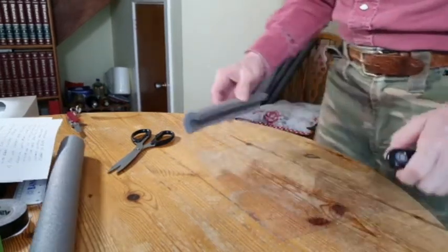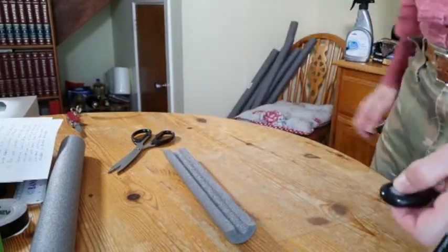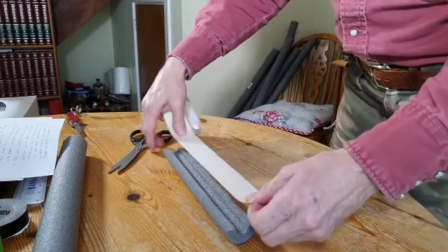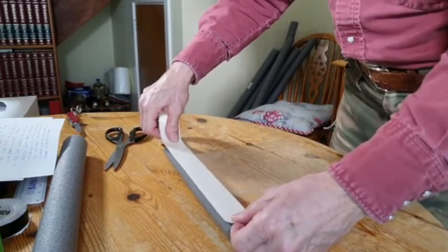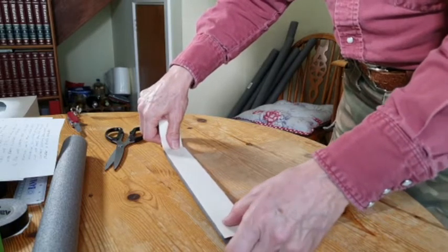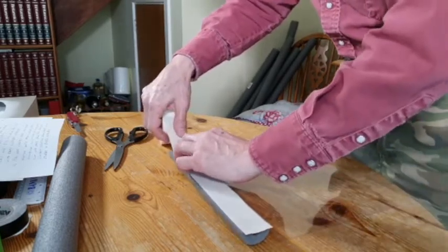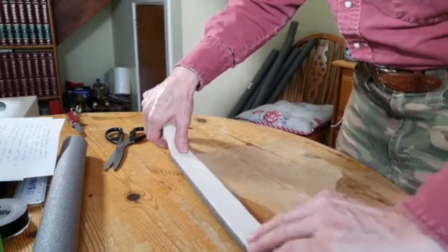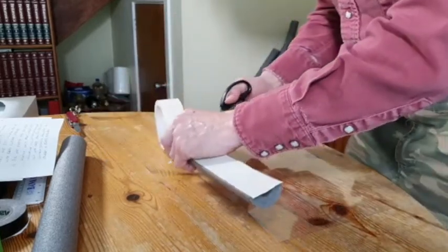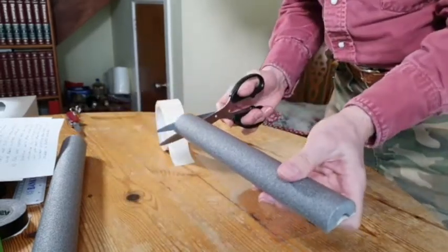Use one half, place it so that the flat is on top. Take your double-sided tape, just draw it across, make it just a little bit longer than the foam. Be careful you get it as middle as you can. Very gently press it on from the centre outwards to reduce the amount of air entrapment, because you want two seals at the top. There we go. Right, cut that off. Trim it to size.